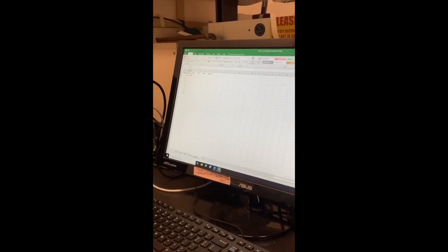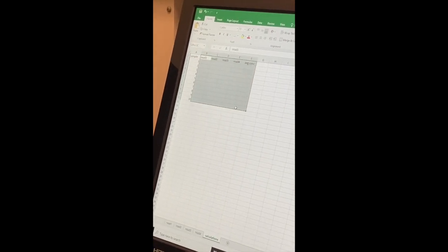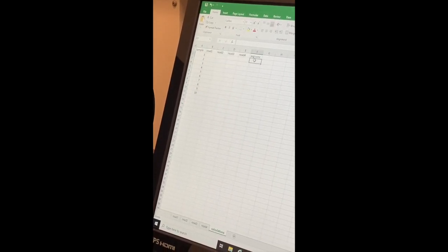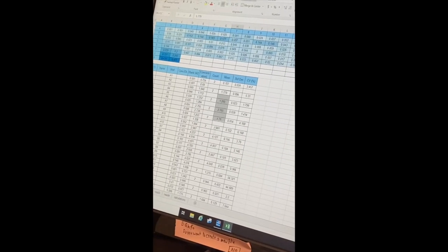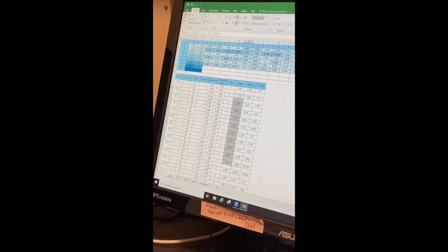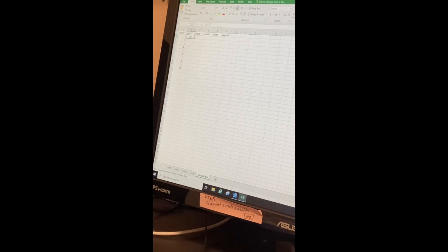And then I have the setup for the reads with my samples, the different concentrations I'm gonna have for the reads, and then I'm gonna calculate the average concentration. So a good way to do this is you select the average mean, and we only want these samples. So I'm gonna copy it, and then I'll paste it.